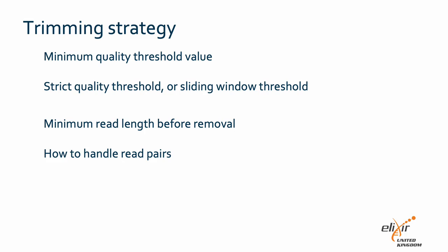Trimming programs often create 4 files: paired read 1, paired read 2, unpaired read 1, and unpaired read 2. Some aligners can work with this directly, others need data back into concatenated and sorted FASTQ files. Users also need to provide the trimming tool with a list of adapter and generally overrepresented sequences.